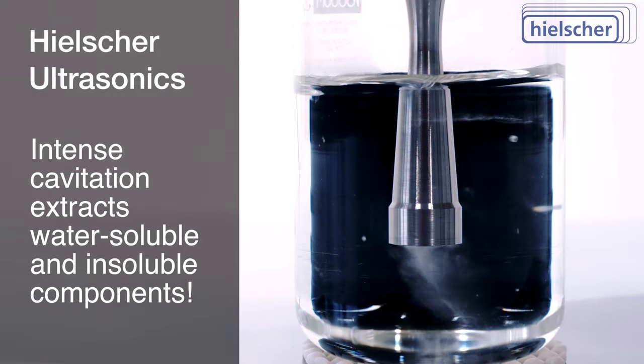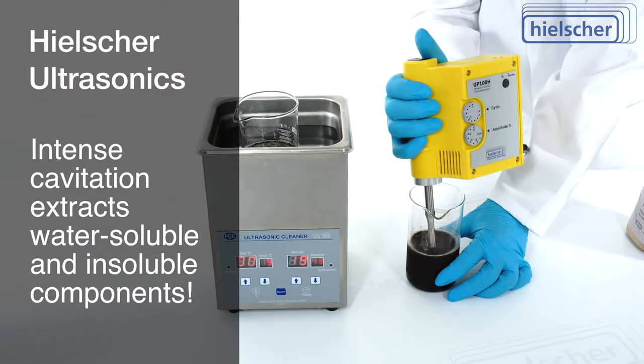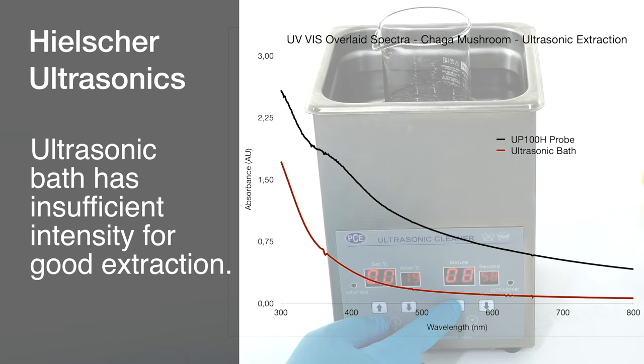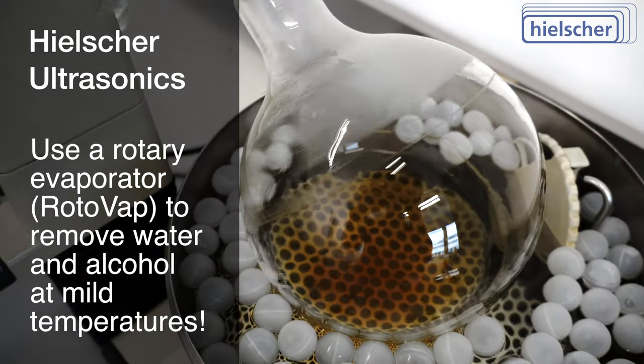The intense cavitation of the UP100H extracts water-soluble and water-insoluble components. The ultrasonic bath, with its low intensity, cannot achieve the same extract quality or yield.